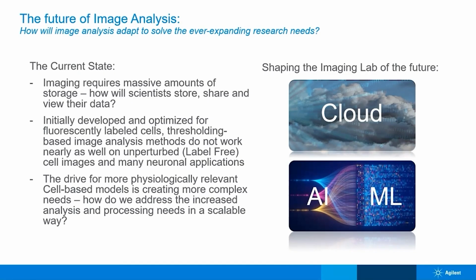Historical methods of digital image analysis were developed based on fluorescent microscopy images, where thresholding was used to separate dark backgrounds from bright cells in the foreground. Those algorithms are suboptimal when applied to label-free image sets. Artificial intelligence and machine learning hold great opportunity in this area to develop new analysis tools that are optimized specifically for label-free applications. It's an exciting time for us, and we look forward to how these new technologies will shape the future of microscopy.